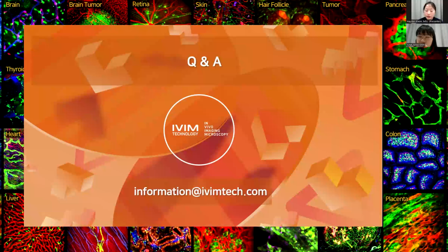However, this duration can vary depending on the number of cancer cells injected. Injecting a large number of cells, especially those with rapid growth characteristics, may push against the glass, reducing the imaging quality. So if you want to observe over a longer period, it is recommended to inject a smaller number of cancer cells.